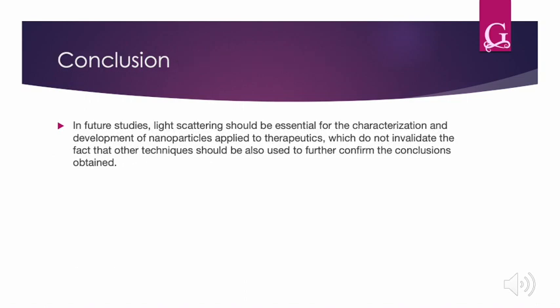Finally, as a conclusion, in future studies, light scattering should be essential for characterization and development of nanoparticles applied to therapeutics, which doesn't invalidate the fact that other techniques should also be used to further confirm the conclusions obtained.